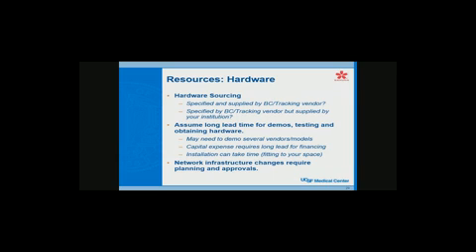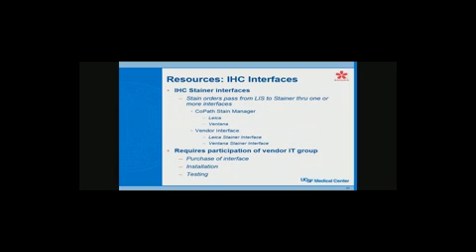And then network infrastructure. Any kind of network infrastructure is going to require IT approval, planning, and installation, and you have to decide if you're doing hard network drops. In other words, you're plugging a wire in, and you're going to have to plan those very well. We thought we planned for everything. We ended up adding half a dozen more when we were finished, just in the laboratory. If you can go wireless, that's great. Some places will not. For our system, they said Copath takes up so much bandwidth that they wouldn't do wireless on it. We had to go hard wiring the whole way.